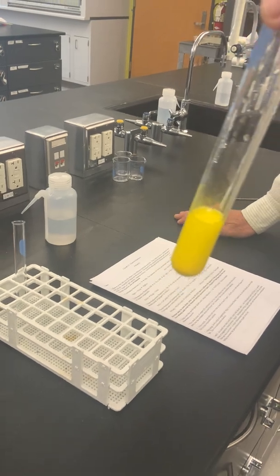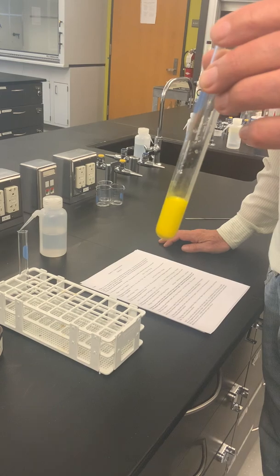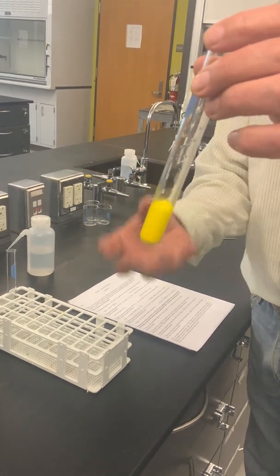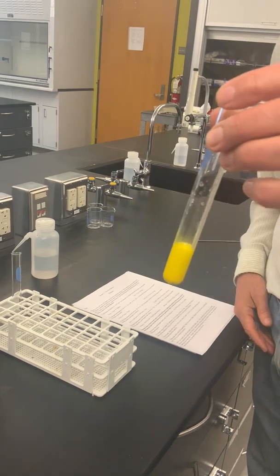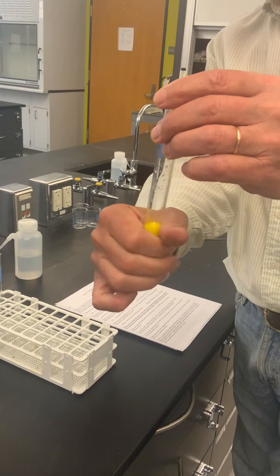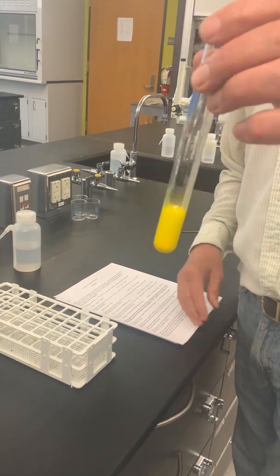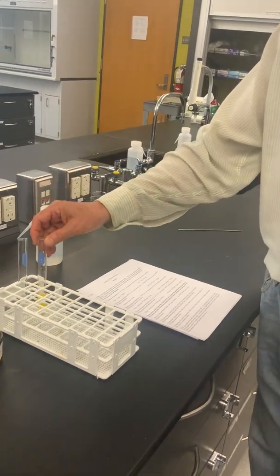For us in chemistry, what that means is that there are solid particles in there, very finely divided and suspended in the water, but nevertheless, the formation of a solid, strongly suggested by the lack of transparency of this new substance. If I put my fingers on the bottom of that test tube, I can't detect any real heat being produced, but we do have those 2 general indicators: dramatic color change and the formation of a solid.